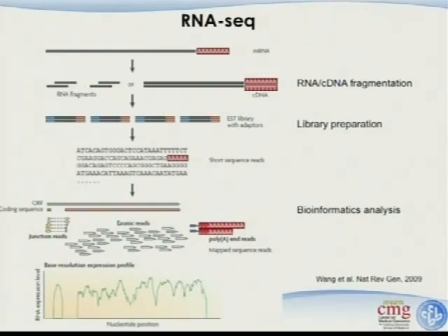We don't do that regularly because our reads are in general pretty short, like 36 or 50 base pairs. But once you go to 100-something base pairs, if you have an extensive chunk of poly-A, you can first find those reads and where the poly-A starts.